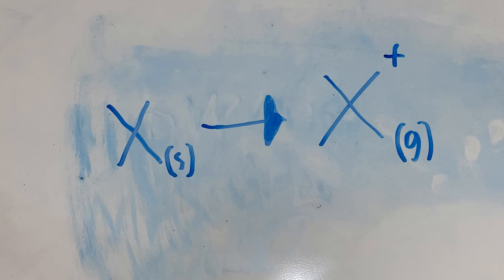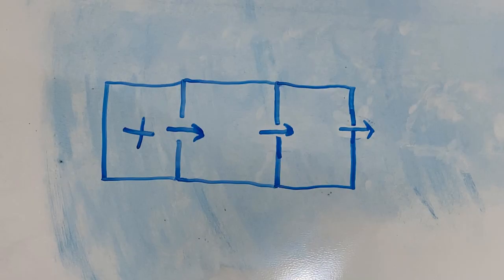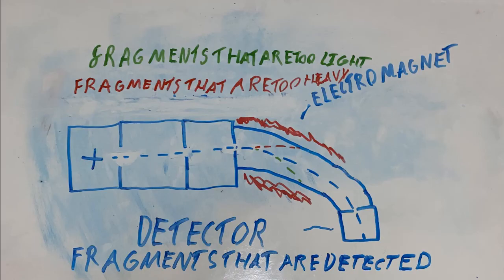Mass spectrometry begins by ionizing vaporized samples of the unknown chemical by shooting high-energy electrons from a metal coil into the vapor, knocking off electrons from the elements inside the chemical. These ions are then accelerated as the ionization chamber is very positively charged. They are then moved through a thin slit to focus the beam. The ions are then deflected using an electromagnet. The ions are deflected towards a detector.